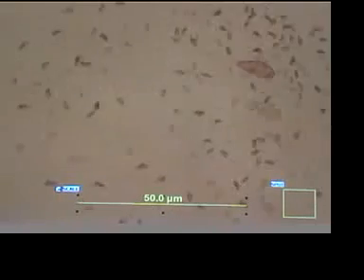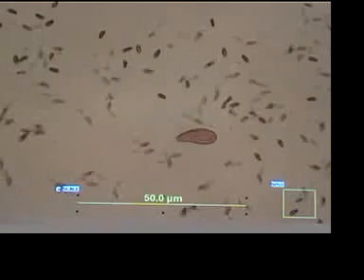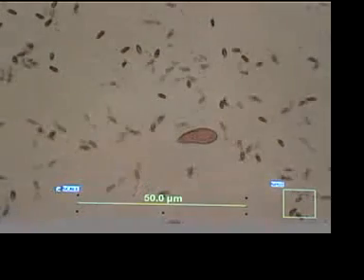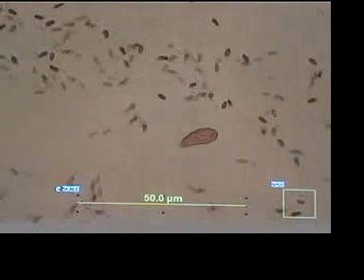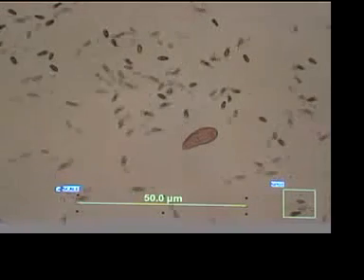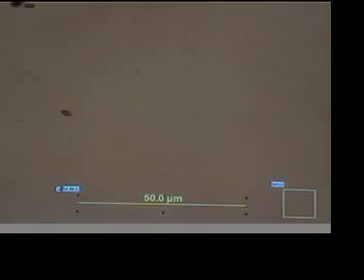There's a Blepharisma who was kind of small and was not terribly affected, but he's not moving. And so there is some water in the slide, or these guys wouldn't be swimming around. Of course, you could say maybe it's not deep enough for the Blepharisma. So we'll run another slide and see, and run the experiment again.